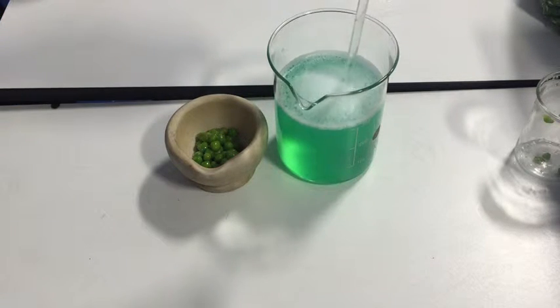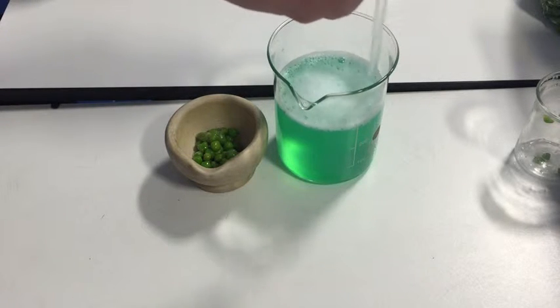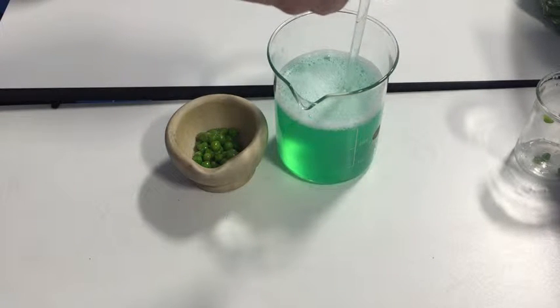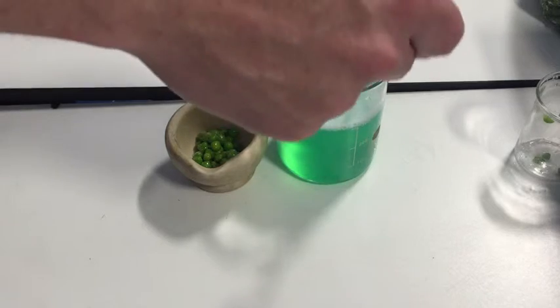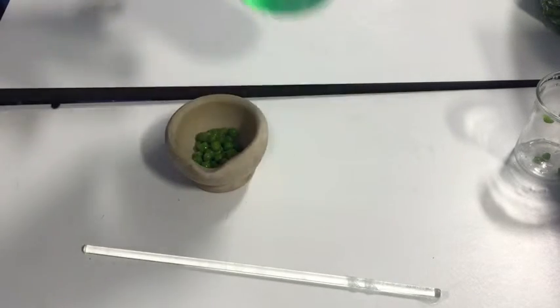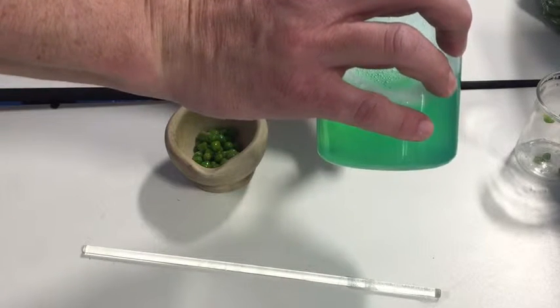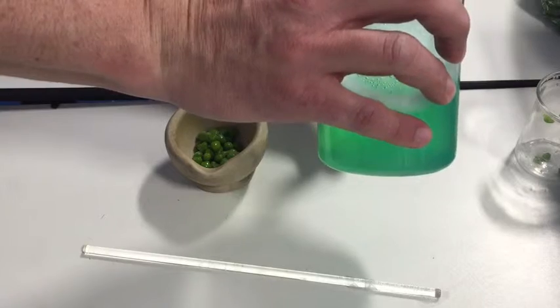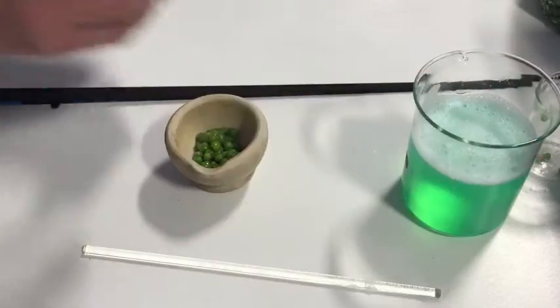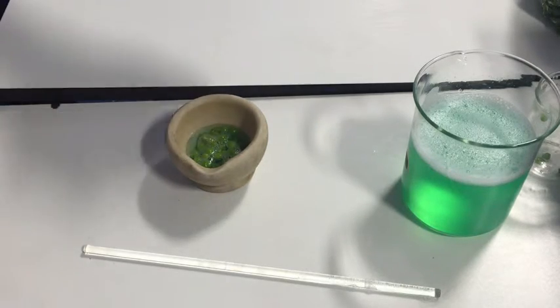What is this solution going to do? Well, if you got washing up liquid in your eyes it would sting — and it's going to sting the cells a lot, because it's going to break open the cells to allow us to get inside and get the DNA. We take 10 millilitres of this using a measuring cylinder and pour it into our peas to make pea soup.